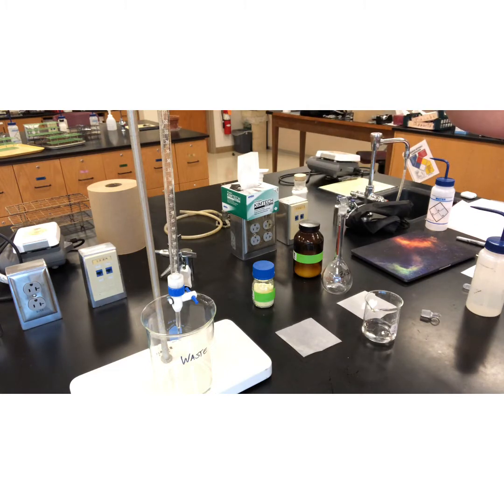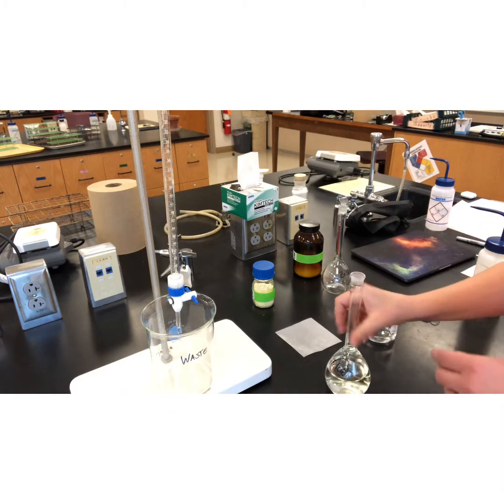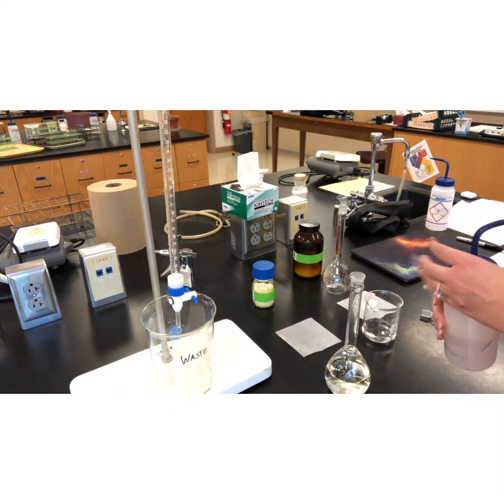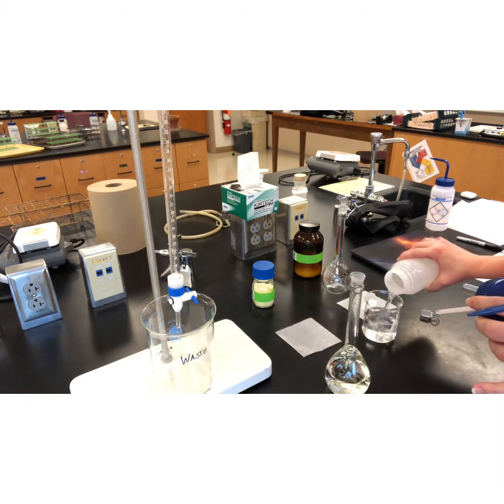All right. Keep swirling, swirling, swirling. I need some more DI water. I'm going to put some more in this container into my beaker.